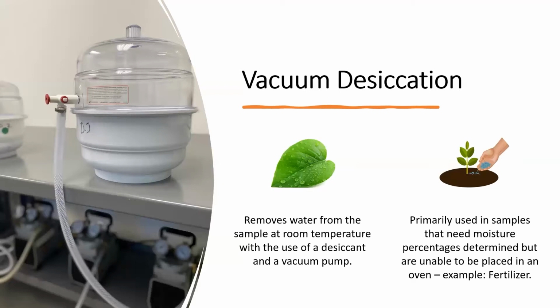Knowing what we do about the semi-volatile and volatile nature of the compounds that are present in cannabis, we knew that the methodology we had previously used to test fertilizer would be the best starting point for obtaining an accurate moisture in cannabis flower. This is a method we began using in our laboratory over 4 years ago, and we believe that today's presentation will show that though this method may not be perfect, it is a much more accurate measurement for moisture, especially in cannabis flower.